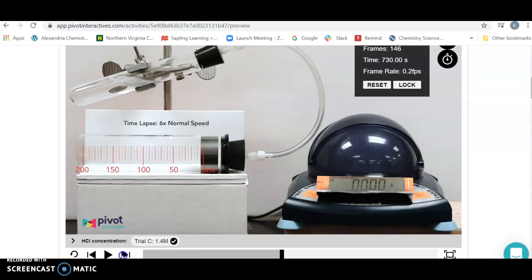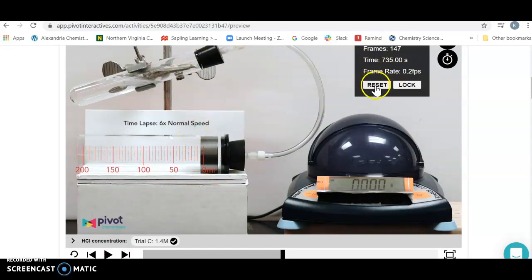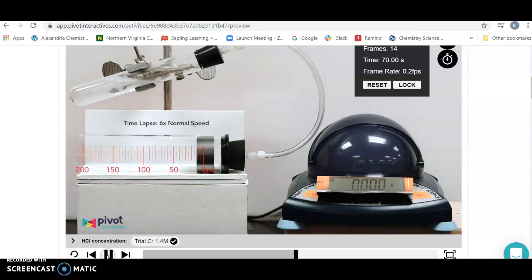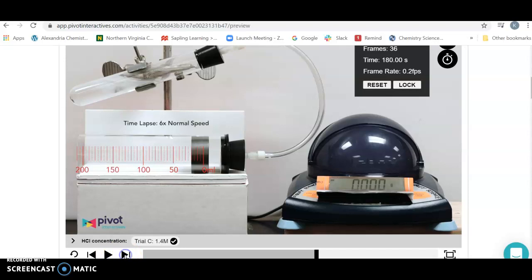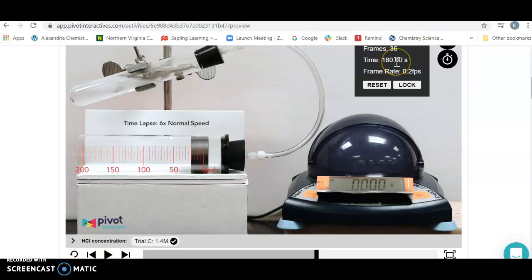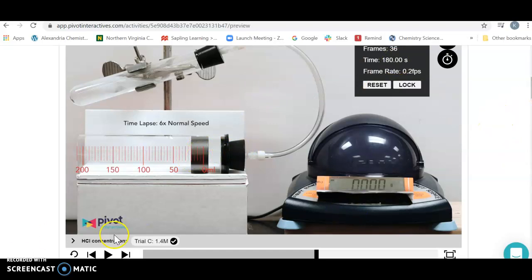The 5 mil mark is about right there. Once it hits 5 mils, that's going to be our starting point. Hit reset so you're at time zero, then press play and we're going to stop when it gets to 20. This takes sometimes longer than we'd like or faster, so you're going to have to use finesse and ease your way there. It took 180 seconds to make 15 mils of hydrogen gas, from 5 to 20. That is for 1.4 molar.